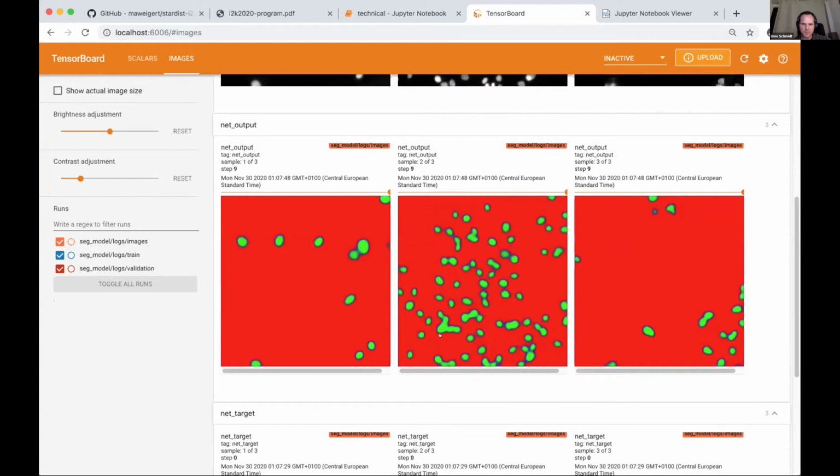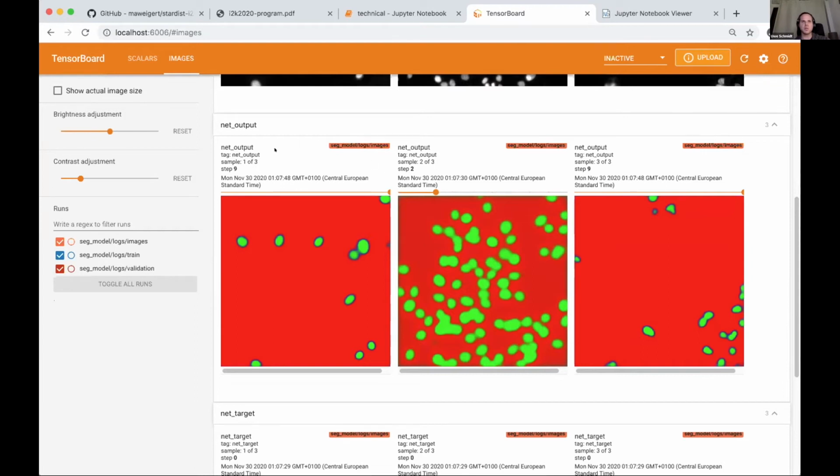What is super useful when you start a training and you made some mistake is that you can immediately see right away when your training goes wrong, because after the first epoch, you can immediately see how the predictions of the model change over time for your images. So in case you're a developer, you can also do this for StarDist and CSBDeep. This TensorBoard thing is always logged, and you can always monitor the progress of your training in this TensorBoard and look how the prediction for 3 validation images changes over time.